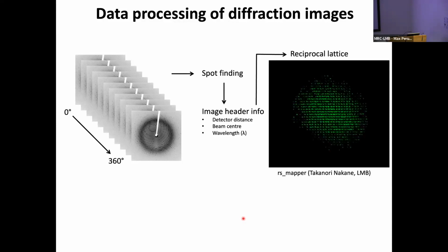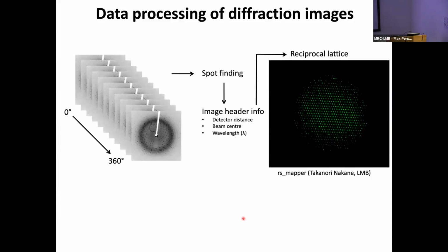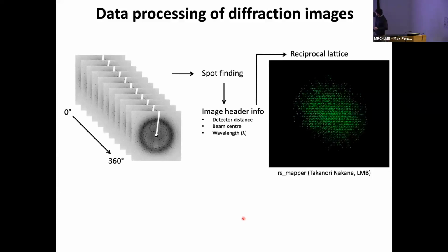If you look along one of the axes, you will start to see what we're talking about, the reciprocal lattice. Do you see it? This was like a P222. You had like 90 degrees on each side. Okay, this is P21. It's got one of the angles not 90 degrees, sorry.